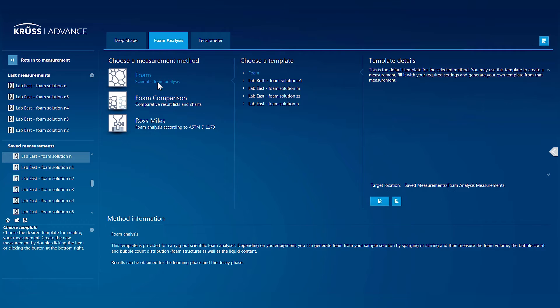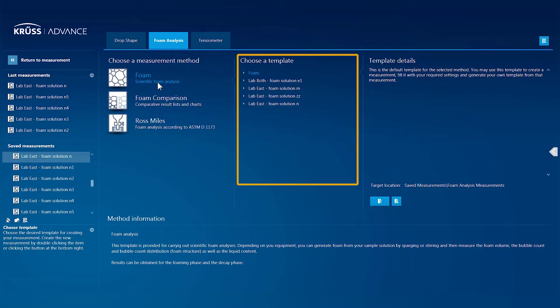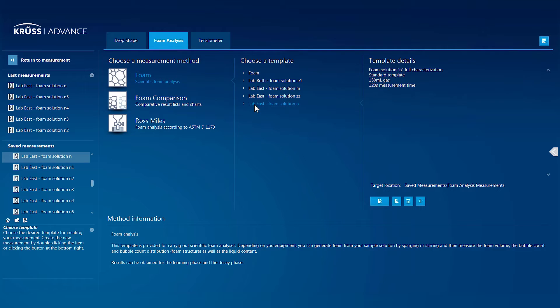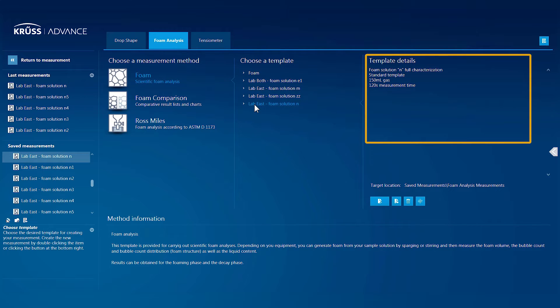Now, the available measurement templates for that method are displayed. The template details give you the chance to make your own notes or descriptions, which are saved with the template.